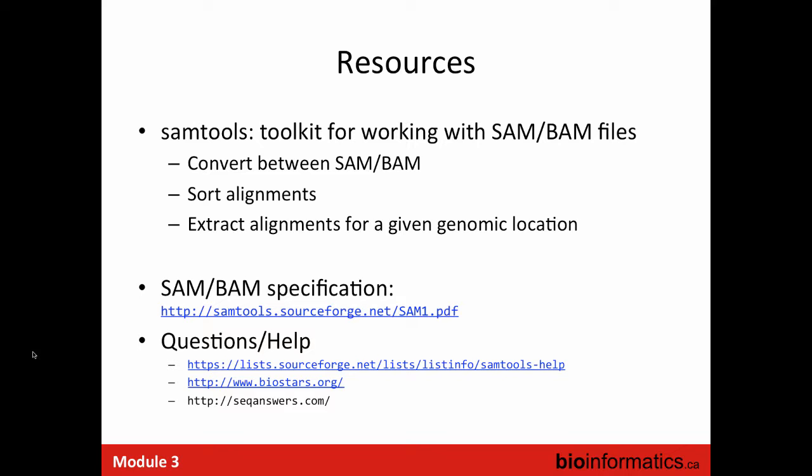Yeah, I was going to say that, but I didn't want to offend any Java programmers. But yeah, generally compiled C programs are a little faster than Java programs. So I'd expect that SAM Tools is a bit faster. Yeah, I just discovered the threaded option in Picard Tools before. I knew that SAM Tools also offers a threaded version because it was taking forever for some of the larger files. Right. So the second bullet here is just a link to the specification for the SAM file.